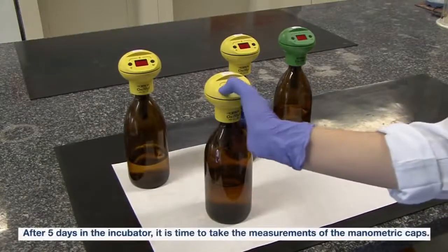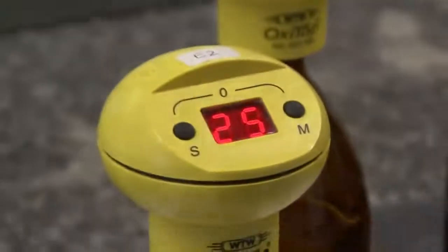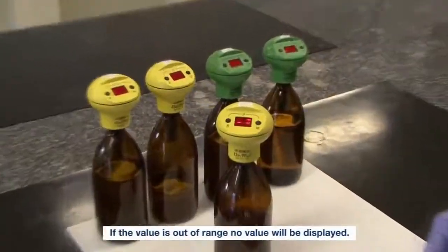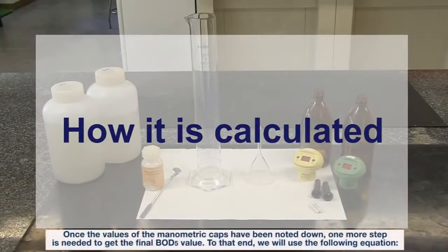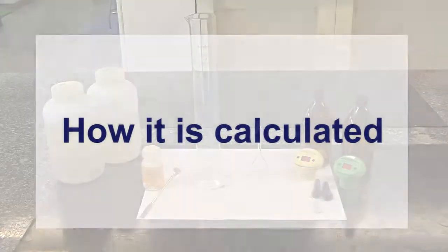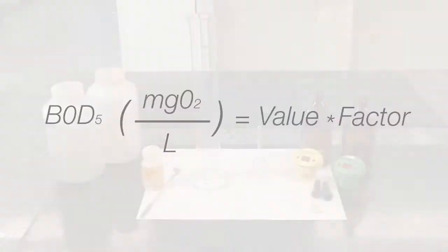After 5 days in the incubator, it is time to take the measurements of the manometric caps. If the value is out of range, no value will be displayed. Once the values of the manometric caps have been noted down, one more step is needed to get the final BOD5 value. To that end, we will use the following equation, where the term factor appearing in the formula corresponds to the figure obtained from the standard table for our specific sample volume.